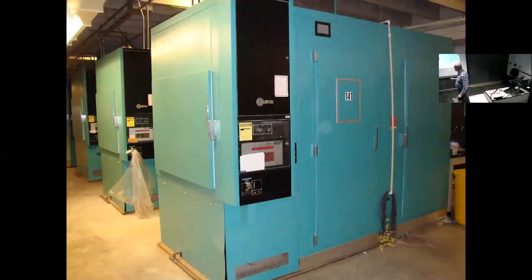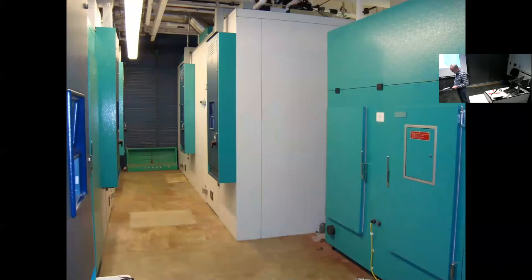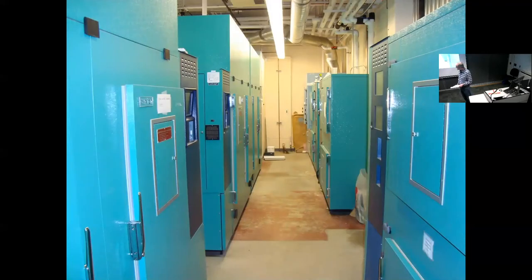So over the next few decades, additional chambers were sort of added to the fleet here and there. Maybe a professor would write an equipment grant or brought chambers with them when they came here from another university. Then in 2000 or thereabouts, Emerson Hall was renovated to include a large chamber room in the basement where 23 Conviron growth chambers were installed, and they would serve the research projects in the Bradfield, Emerson, and Plant Science area. These were state-of-the-art chambers. They had a central computer and digital controls and humidity, which was new for chambers back then. At this point, all of the chambers that Cornell now had were the traditional kind of chambers in the sense that the temperature control was achieved through compressors and refrigeration for cooling and electric heaters for heating. That's the traditional style, and it still is the traditional style in most places.